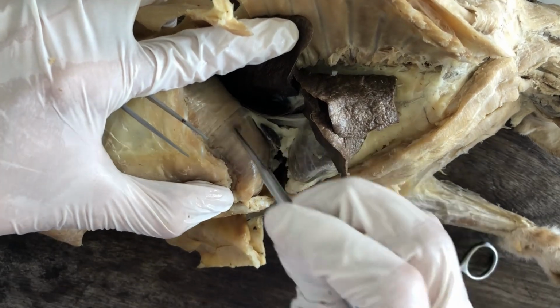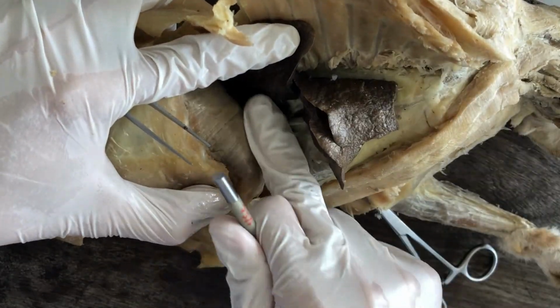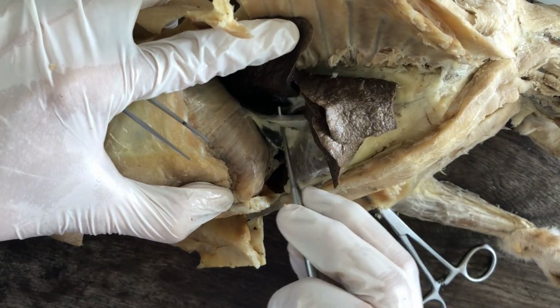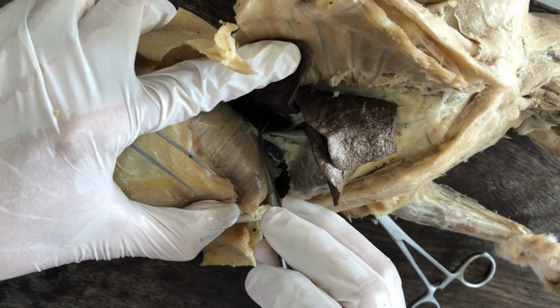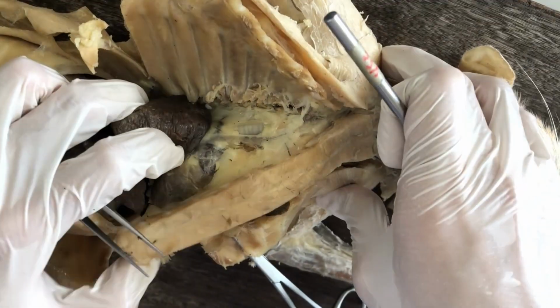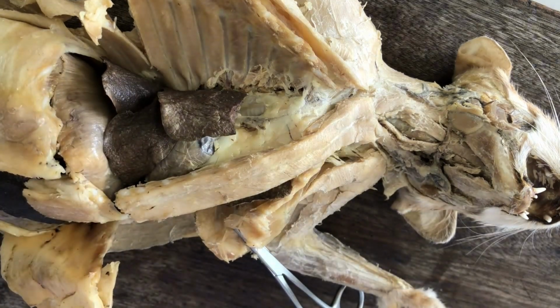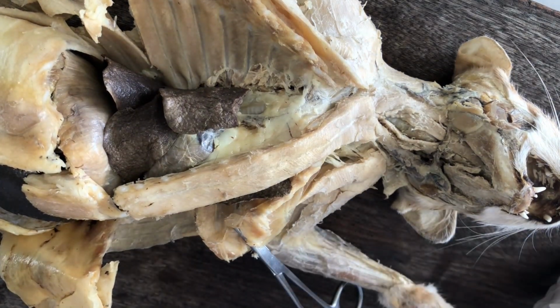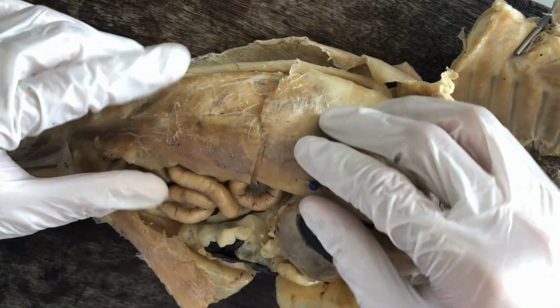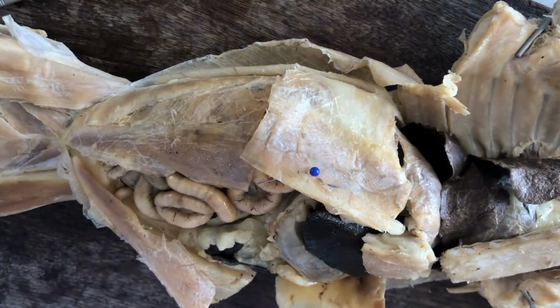And when you first open the pleural cavities, they're still covered by the caval fold. Okay, so you have to do some dissection to see them. Postcava, medial lobule, precava, and those are the structures you need to know inside the pleural cavity. Coming next, we examine the contents of the peritoneal cavity, and see you then.